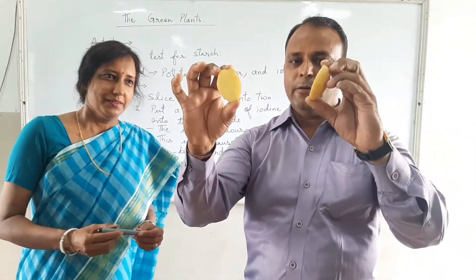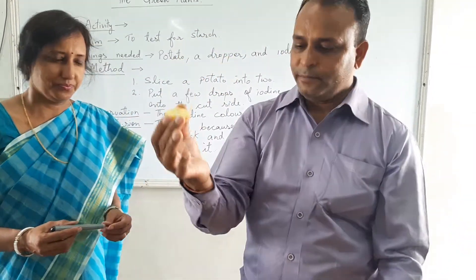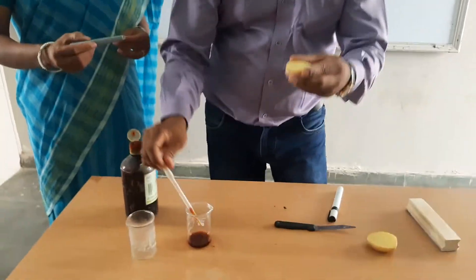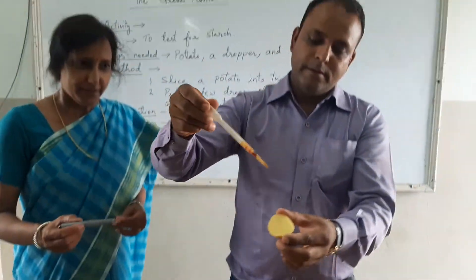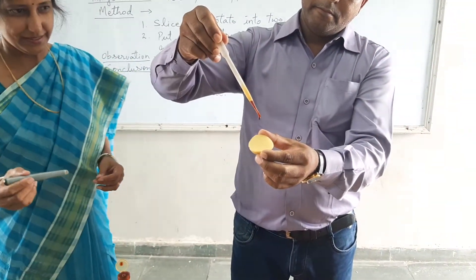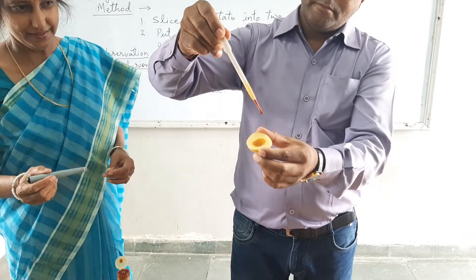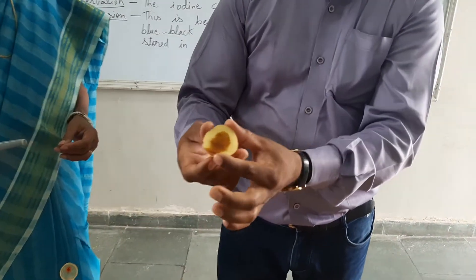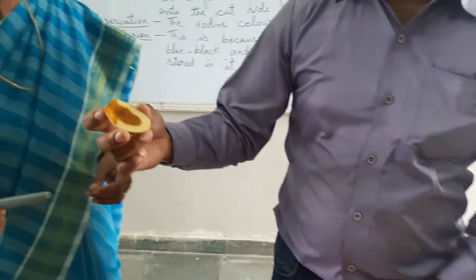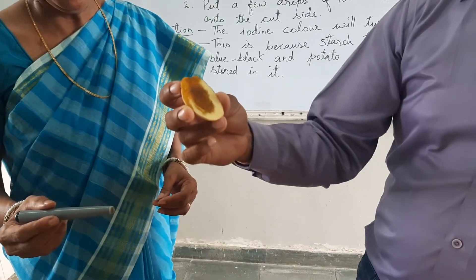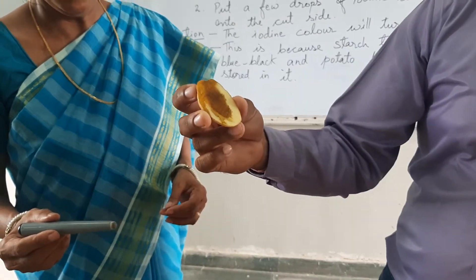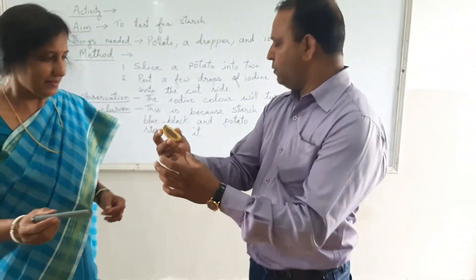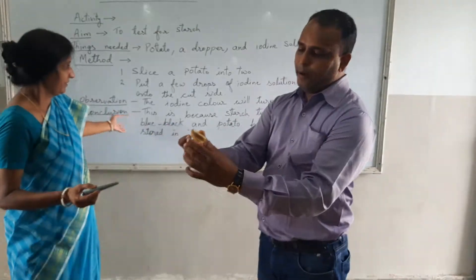Cut up a potato into slices. Take it — you can see the yellow color of the potato. Now put drops of iodine solution onto the cut potato using the dropper. After some time, this potato has changed color to blue and black — dark blue and black.